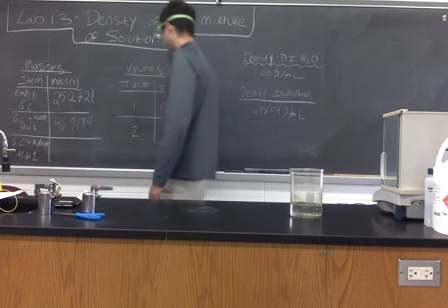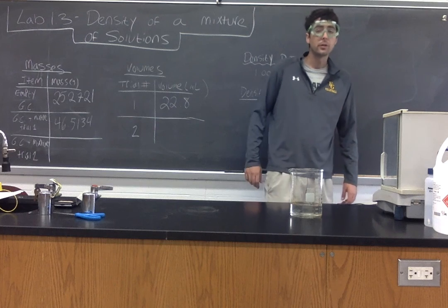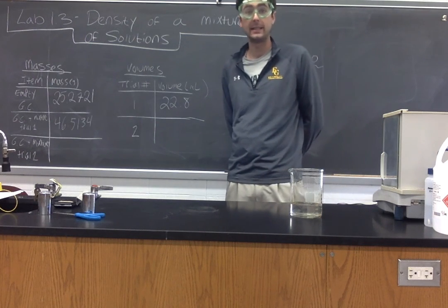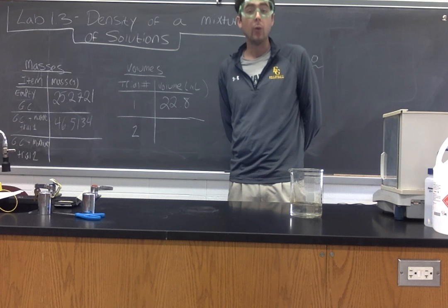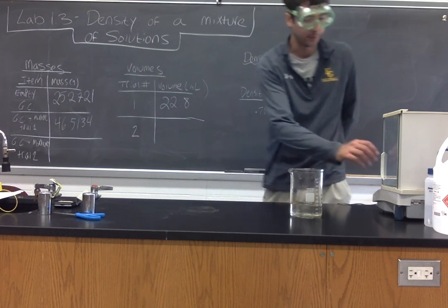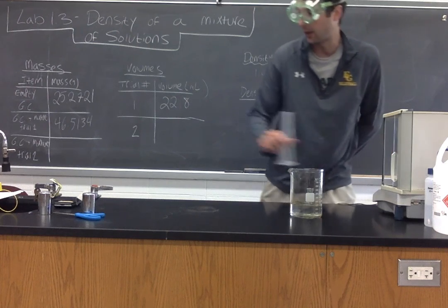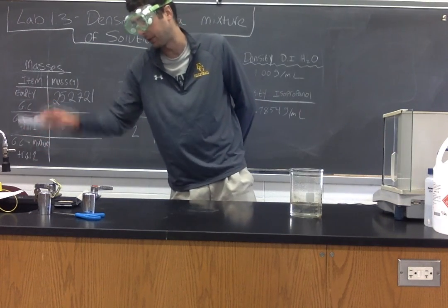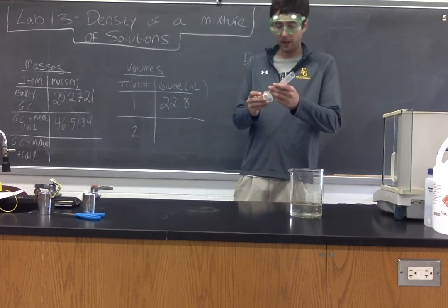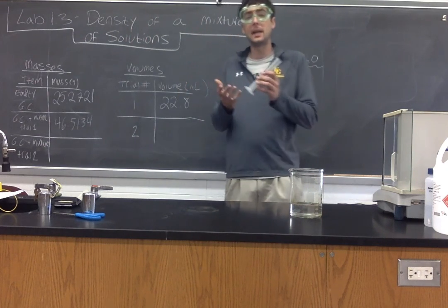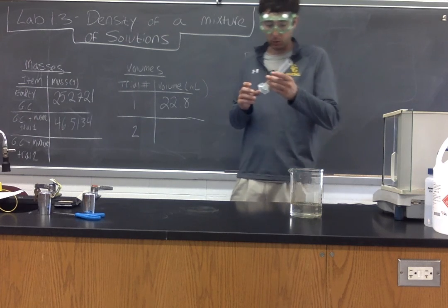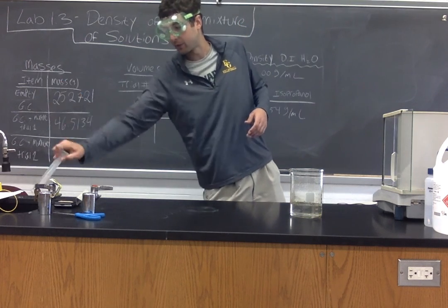At this point I'm going to take the mass again. 46.5134 grams. So at this point we are done with trial one. We have enough information to find the density of our mixture. We are going to run a second trial with a different volume. So I'm using the same graduated cylinder. I do not need to mass the empty graduated cylinder again for a couple of reasons.